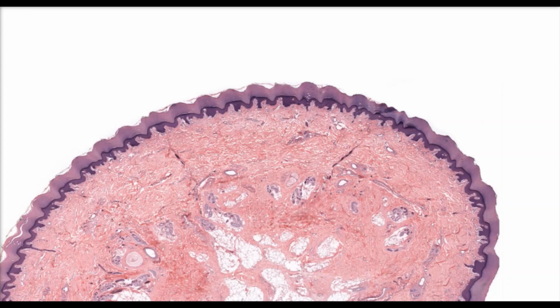In order to see a keratinized stratified squamous epithelium, we need to look at a skin slide. The skin slide that we have on the screen currently is showing thick skin because it's really easy to see the keratinized stratified squamous on a thick skin sample. When we look at this skin slide, we can see the two layers of the skin.